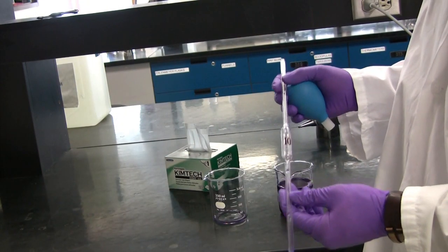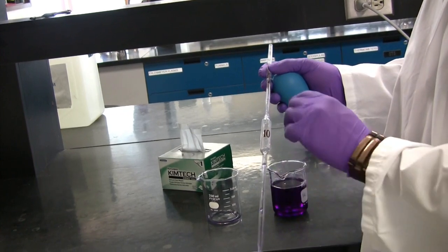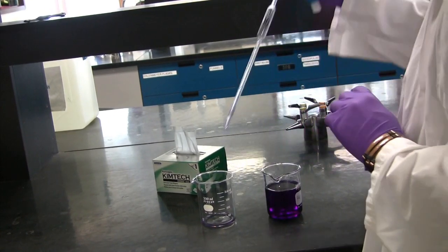The volumetric pipette is similar to the graduated pipette, but it requires all the solution inside of it at this mark. There is no excess.